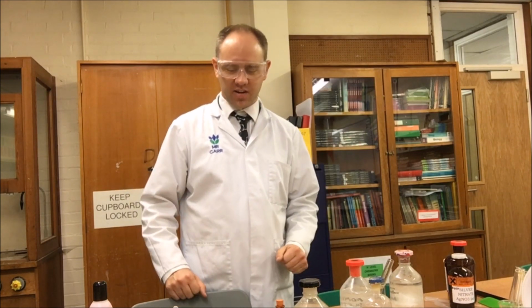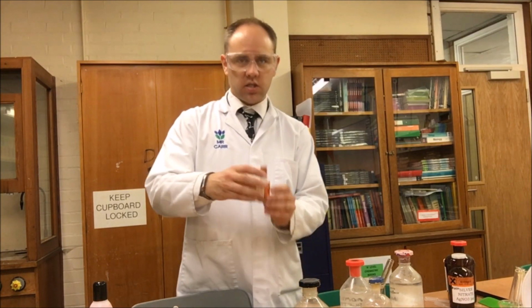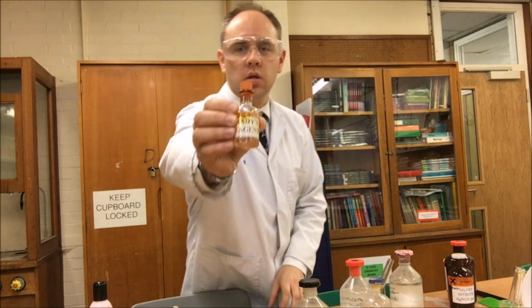Good afternoon. Unfortunately, we're not able to do this in the lecture theatre, so I thought we would do this here in the lab and I would show you via a cam. Now, what we are going to test for today is the presence of the carbonyl group using this little orange chemical here.